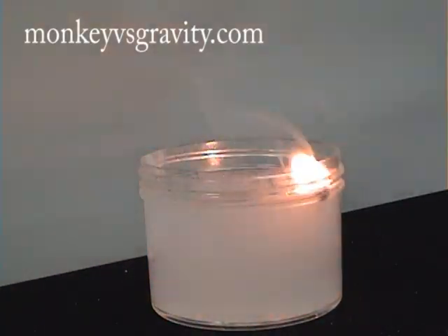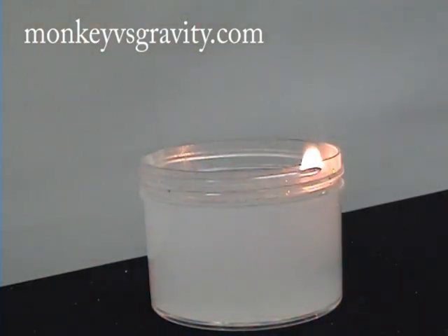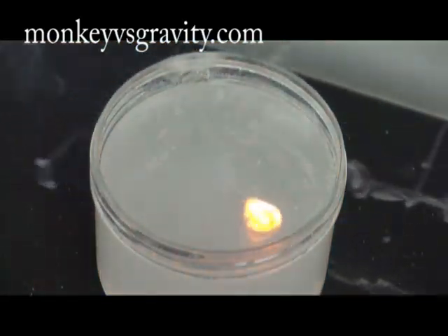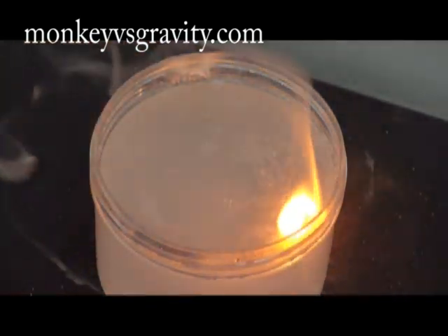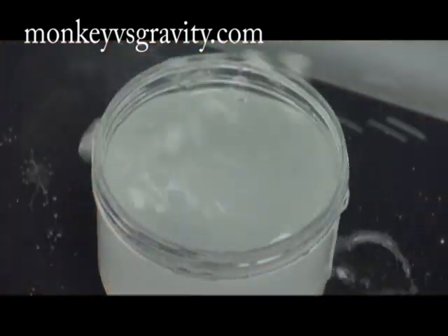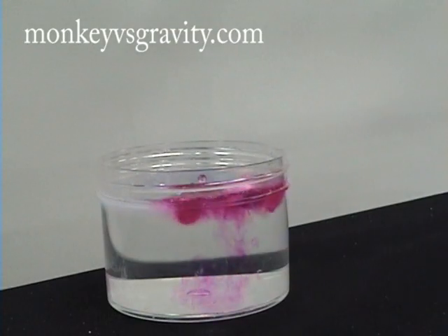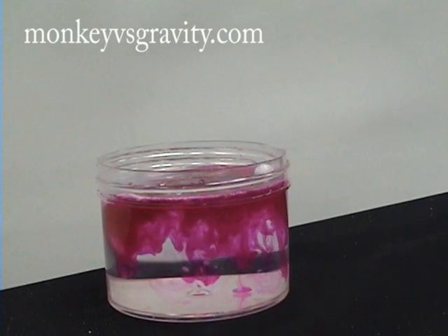Sometimes the heat of the reaction causes the hydrogen gas to ignite. Under the right conditions, this may even cause an explosion.